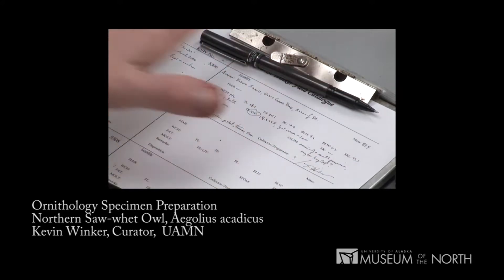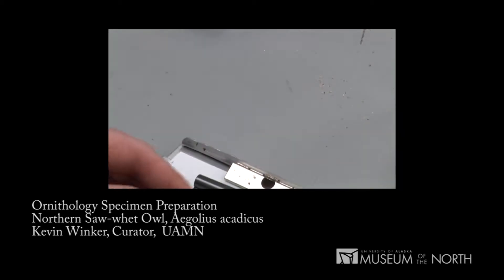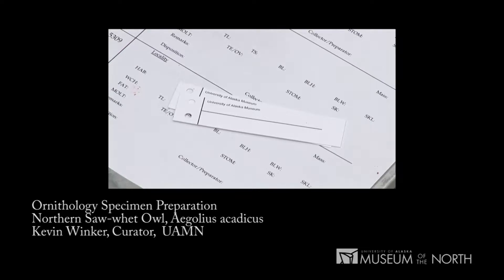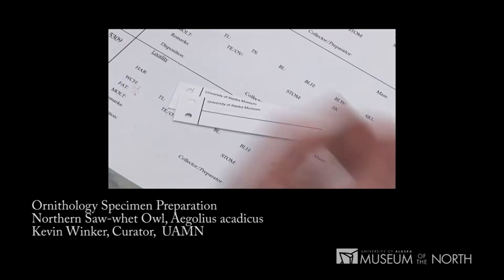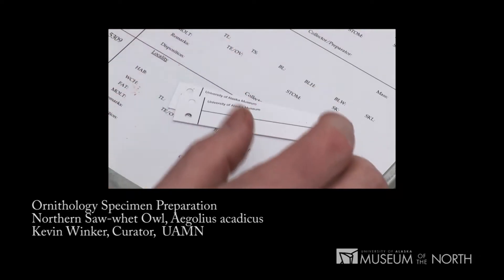I weighed it and measured it earlier. Now, when labeling the tissue vials, I've labeled them with a Sharpie permanent marker. Those are very good for frozen things, but they're very bad for ethanol. If you're going to put a label in ethanol — which we will with the stomach vials — I'll use a technical pen. I'll also use that for writing the specimen labels.